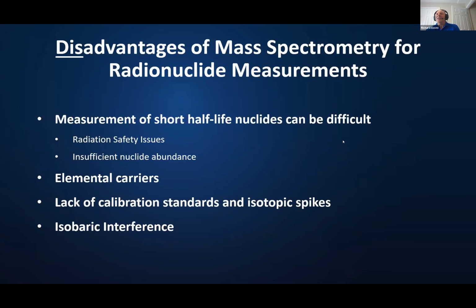Actually, that's something Lisa mentioned that I've thought about a little bit, but not really put a bunch of time into: for measuring very short-lived isotopes, would it be possible to use a mass spectrometer and essentially input the particular nuclide into a detector and then watch it decay in that detector, using mass spectrometry as a separation technique? I think that is done in some nuclear data applications.